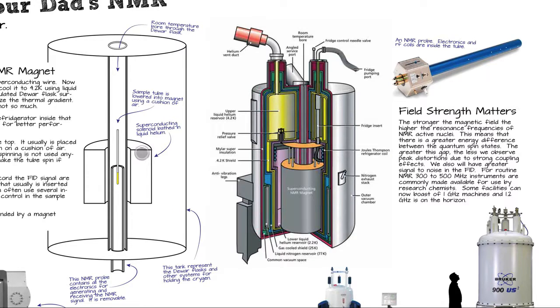The permanent part of your magnet that you can't change, of course, is the magnet itself. And then your sample can be lowered down and raised up and changed whenever you like. This is sort of a fairly advanced superconducting magnet right here. You've got your liquid helium that surrounds the magnet. This liquid helium, however, is surrounded by another layer of liquid helium. This inner layer of liquid helium is being refrigerated to 2 degrees Kelvin. So the heat's being pumped out of this into this. So it's even colder for higher performance. That's quite amazing. Our magnet just has regular liquid helium in it.